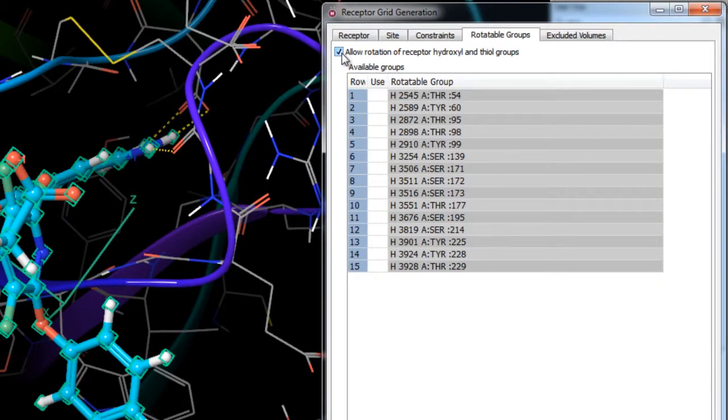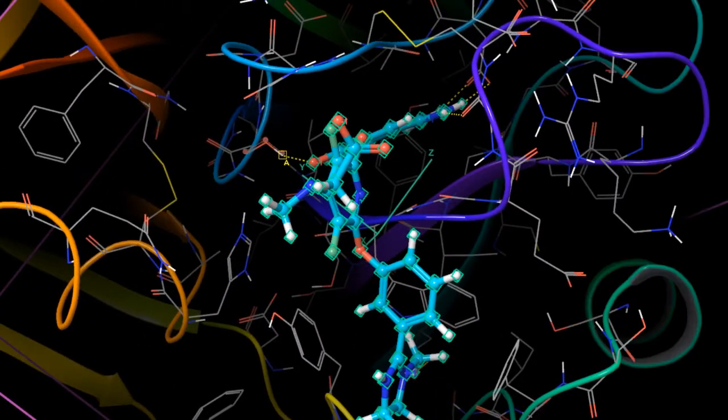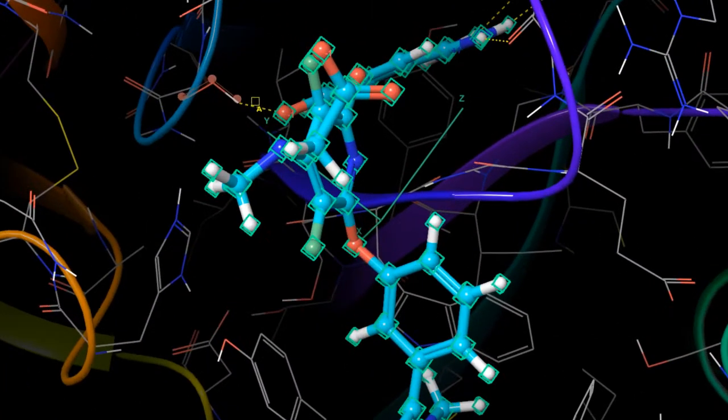To see a list of available rotatable groups within the grid box, you can either check the box to use that particular rotatable group, or simply ensure pick groups is turned on and then pick the hydrogen atom of the hydroxyl or thiol in the workspace.